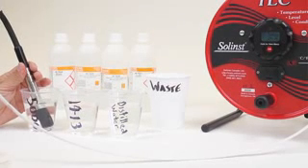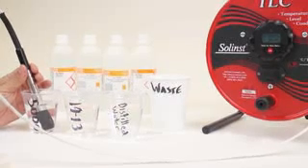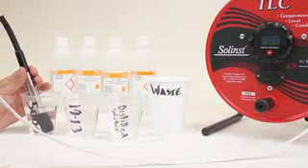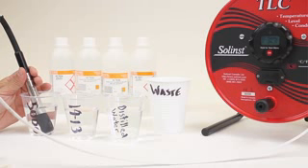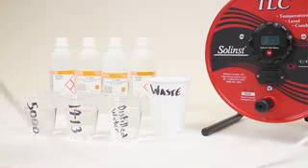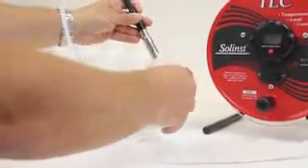It shows a reading in this calibration solution of 5002, and you'll note that the temperature is still 24.3. It's moved between 24.3 and 24.4, so it's very consistent. That's giving me a good reading. Now my conductivity calibration is complete. I'll dry that off, I'll clean it off, I'll complete the operation.